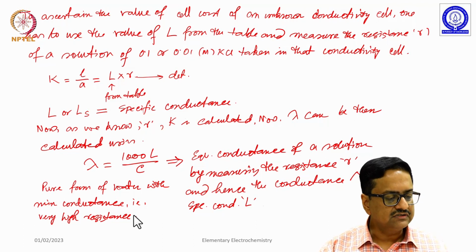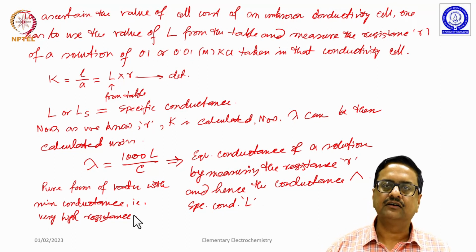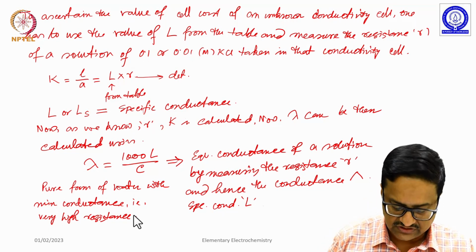One has to use that ultra pure water for the determination of conductance of any solution.